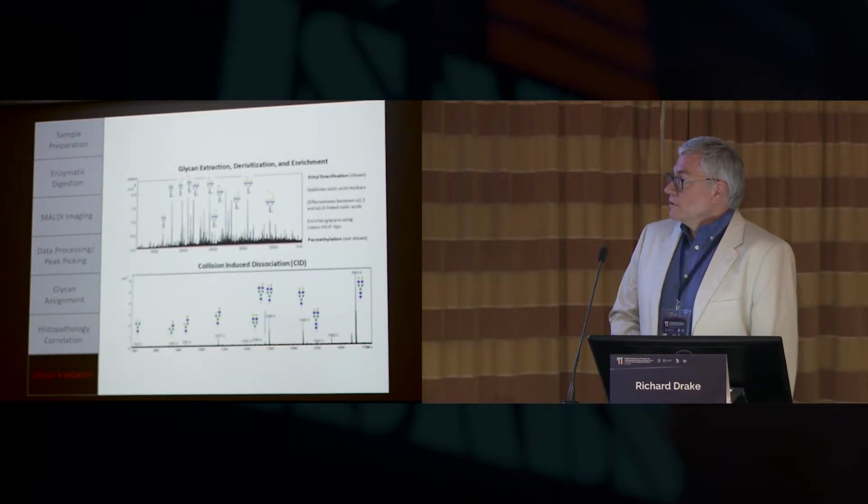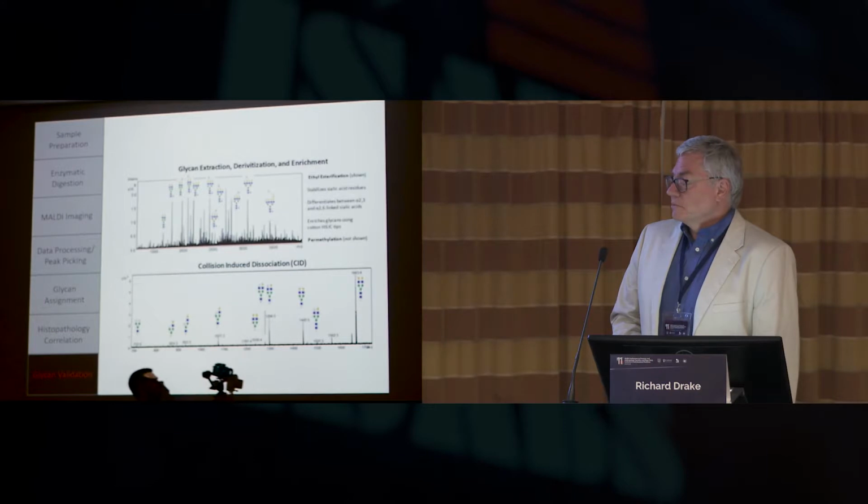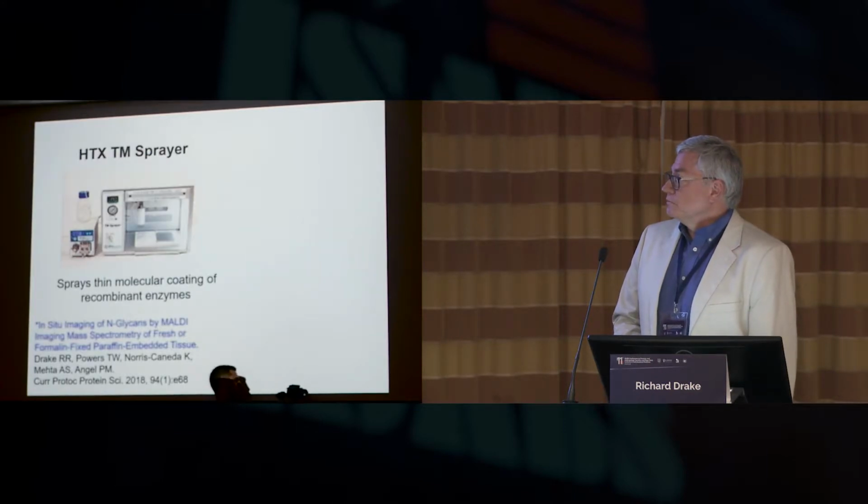Also, once they're released, you can do a lot of different validation. There's some CID functions within the FT. Then there's a new instrument coming, which we'll mention briefly, that'll also be useful.